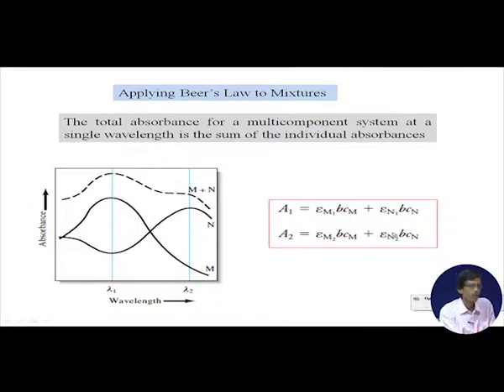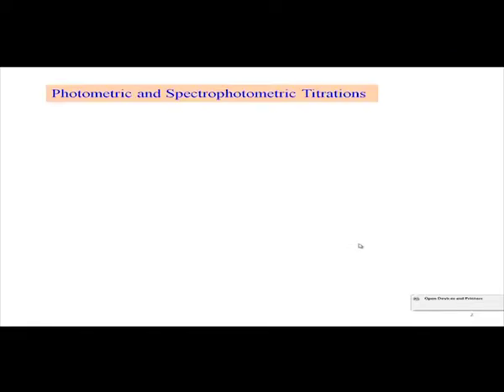We can solve these two equations to get the corresponding concentrations of the unknown palladium and the unknown gold. This is a typical methodology we can follow for identification, and now we can go to a continuous process, because these are the two individual things we have monitored.